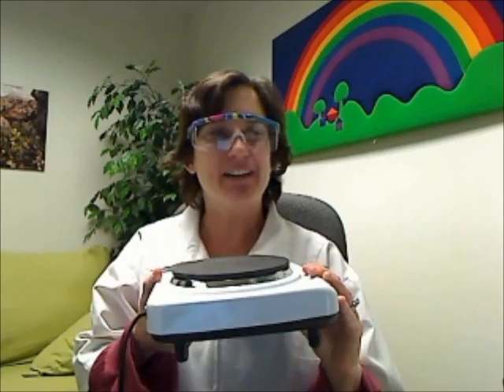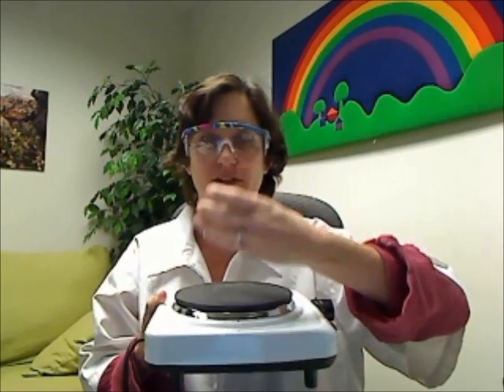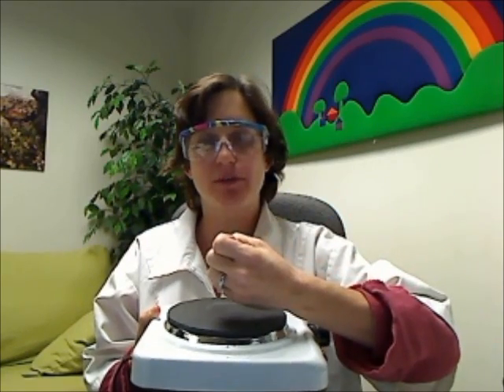Oh, in the lab it says to use a Bunsen burner to heat up your test tubes. Because I am not there, we are making a safety modification, and we are not turning on the gas and using Bunsen burners. What you're going to use is a hot plate, and they are on the cart here. So what you would do is plug this in, and then get a beaker from the side of the room, I don't know, a 200 to 300 milliliter beaker, fill it halfway with water, get it boiling, and then put the test tube in there. And so it's like a double boiler. And if it asks you to heat up a test tube, that's the way to do it instead of using a Bunsen burner.